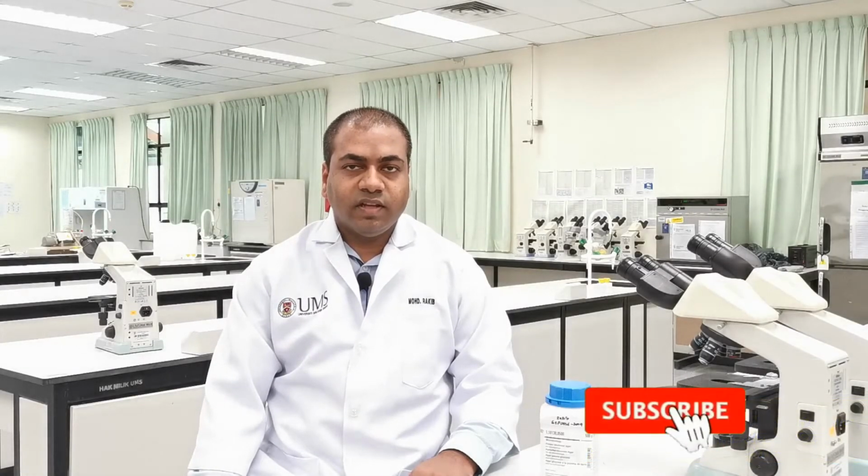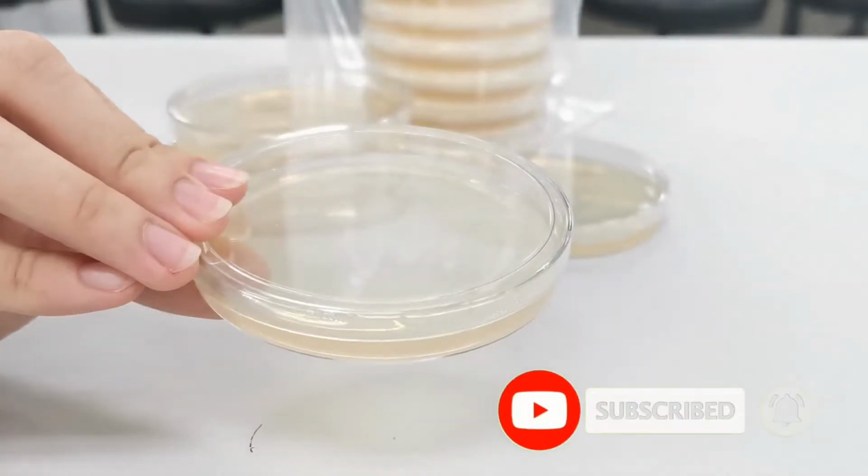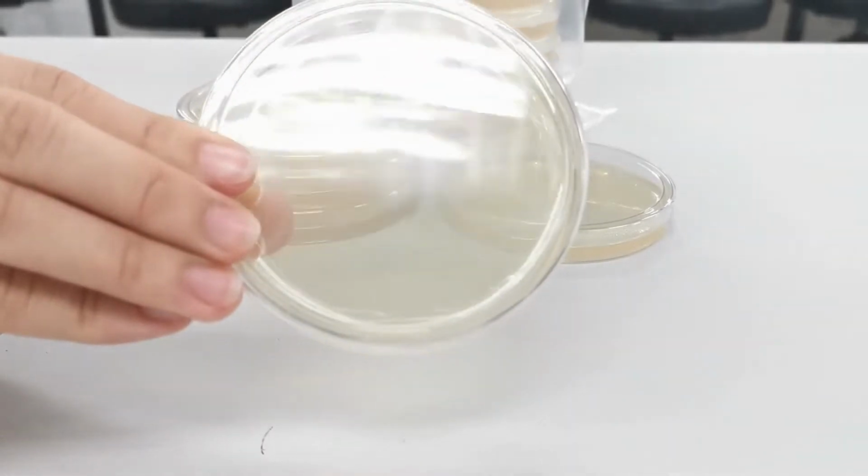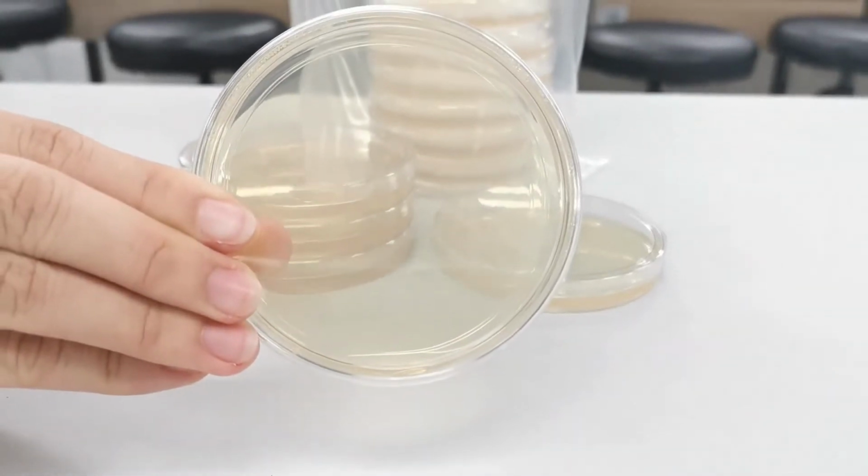Microbiological agar is an important material used in cultivation and isolation of microbes. This video will show you how to prepare potato dextrose agar or PDA. PDA is a microbiological media used for a wide variety of fungi.